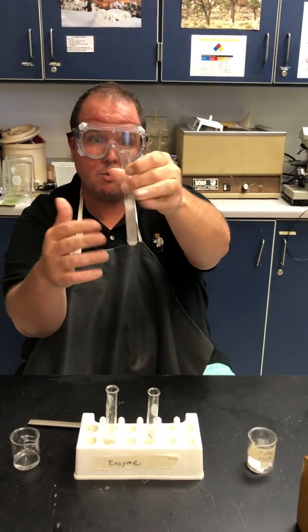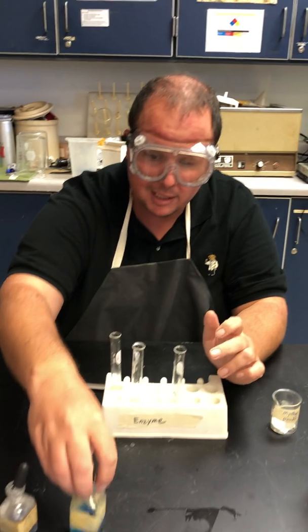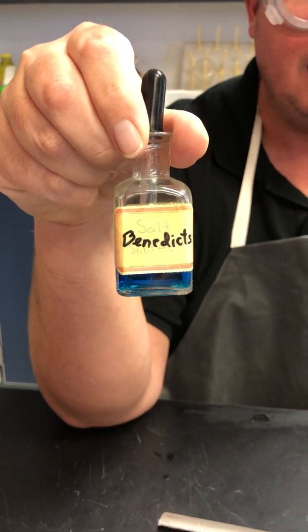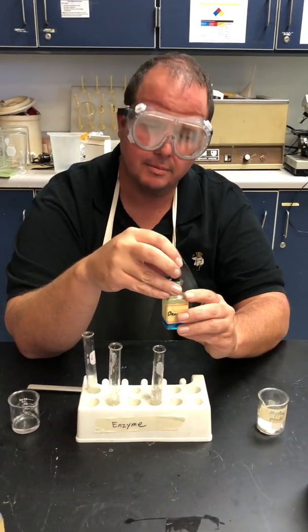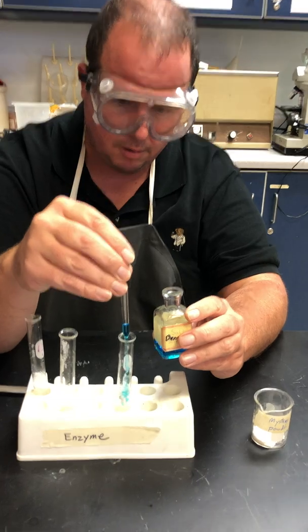Sorry guys, I just want to make sure the water gets a little cloudy so it dissipates through. The first test I'm going to do is Benedict's. With Benedict's, I have to add it in and then heat it. Benedict's will test for glucose. How many drops do you think, Miss Murdoch? Put in 3 droppers full, because you need a lot of Benedict's. 3 droppers full.